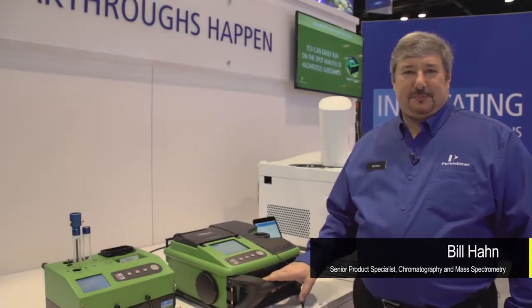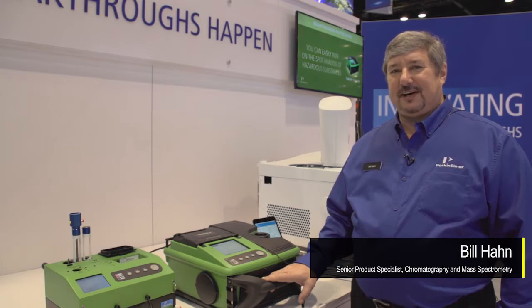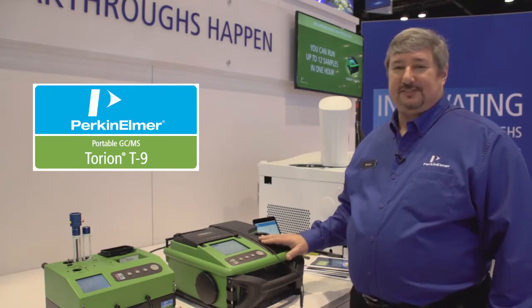Hi, my name is Bill Hahn. I'm with PerkinElmer. I'm a field application scientist for GC and GC mass spec, and I've been working with the Torion T9 — we have a field portable GC mass spec.